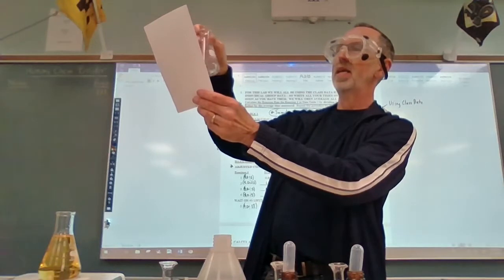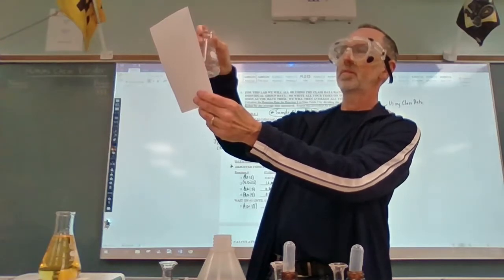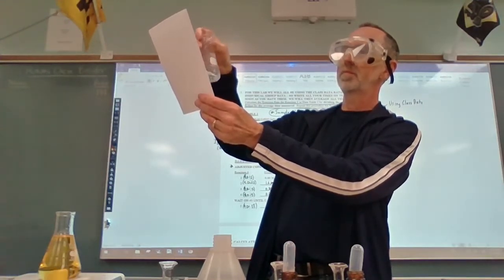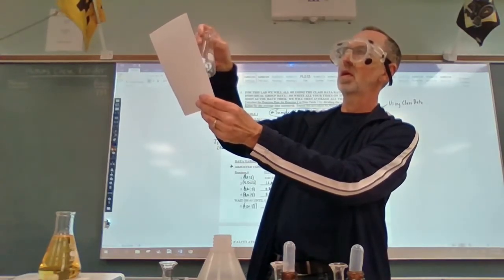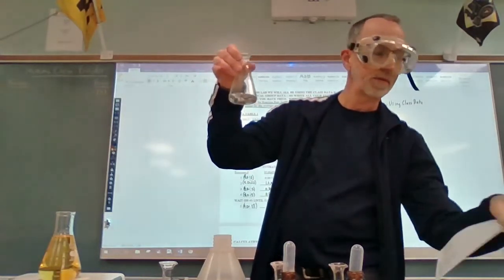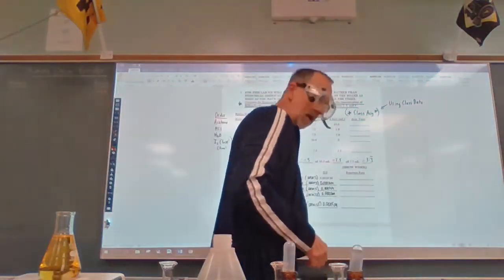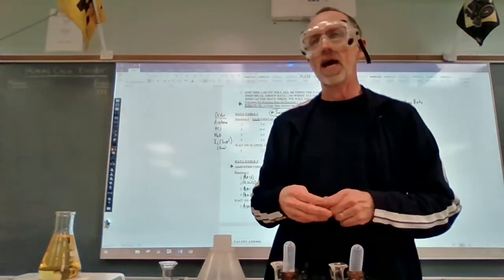It's definitely lightening up some more. We are definitely getting close. I'm going to say we're there. All right. Definitely gone clear. Yep. For that time, I got 52.03 seconds.